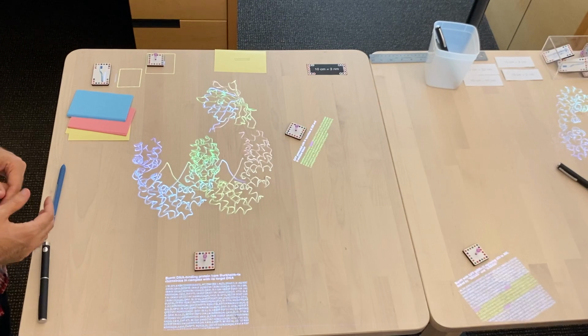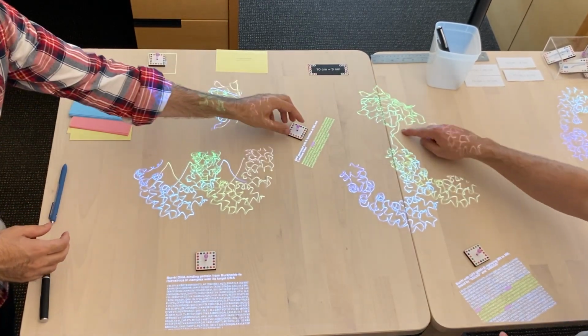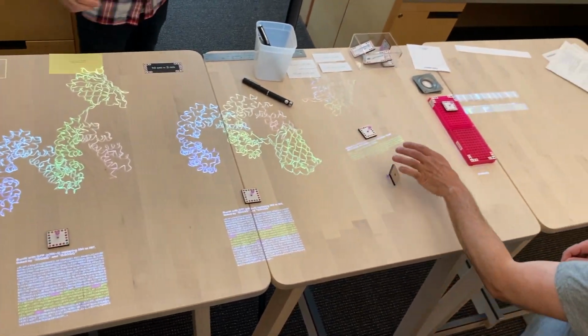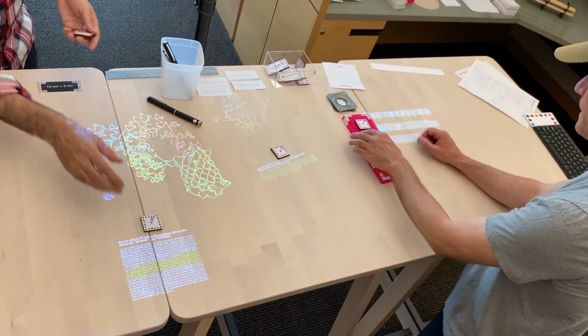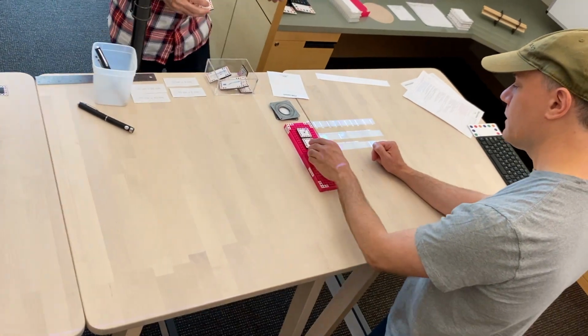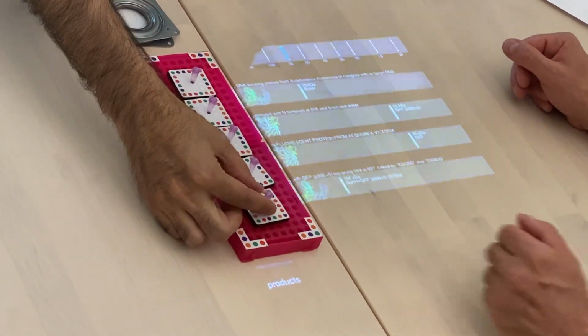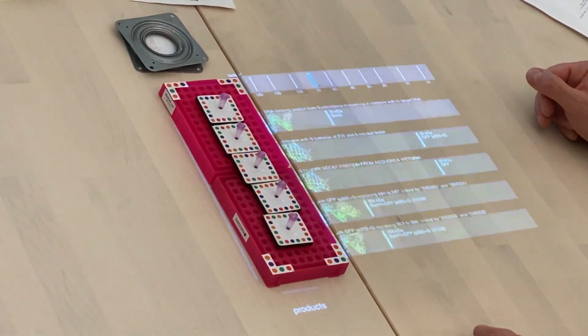So we have these candidate designs on the table, and one way we like to plan an experiment is by envisioning the gel that we expect to see at the end. So here we're organizing our mock tubes on a mock rack, and we see them as lanes on a simulated gel. And this includes both the new proteins we're making as well as intermediate products that we'll want as controls.